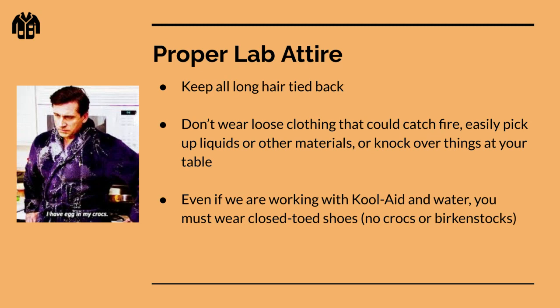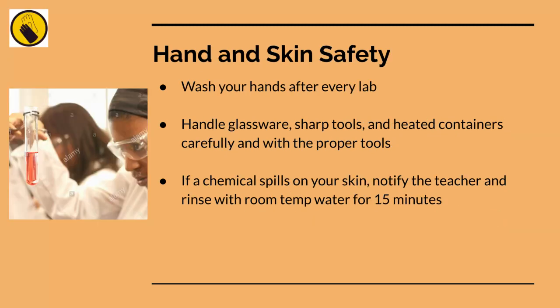And that's not cool because in the case of, say, the Kool-Aid lab, we do work with glassware. Well, what happens if you accidentally hit a beaker on the side of the table and now you've got shards of glass coming towards your toes and you're wearing Crocs or flip-flops? You can probably say goodbye to a toe or two, or at least you're going to get cut up really bad. And I don't want that to happen in the class. So we've got to wear closed-toed shoes on lab days. We've got to keep our hair tied back. We need to keep super baggy clothing away from our lab station.